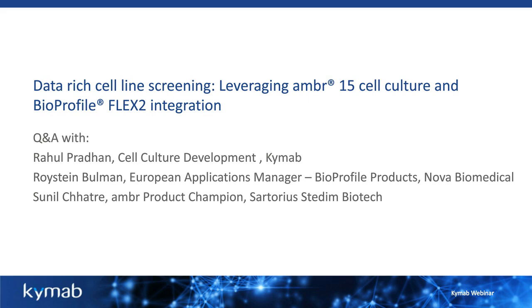You can use the value from the analyzer, feed that into the equation, and get the ambr to automatically work out how much of a feed, for example, needs to be added. You can also use, for example, if expressions, similar to the if expressions you see in Excel, in order to bound the amounts of liquid that are added. So to ensure that you don't add too much or too little, you can restrict the amounts that go through by applying suitable if expressions within the equation editor. And that's something that I see quite a few customers using when they run equations on the ambr15.